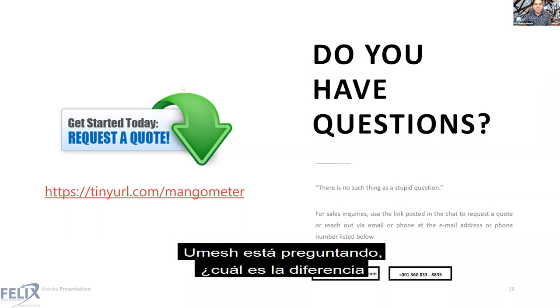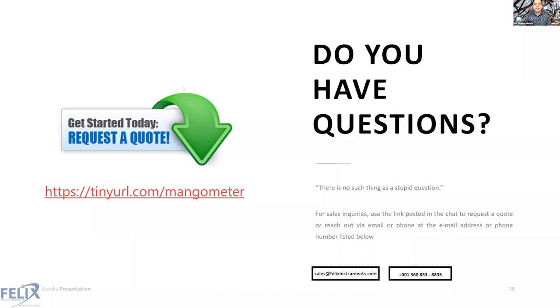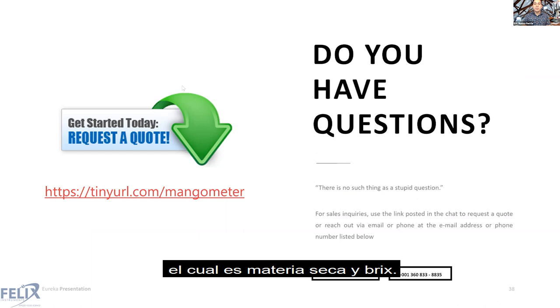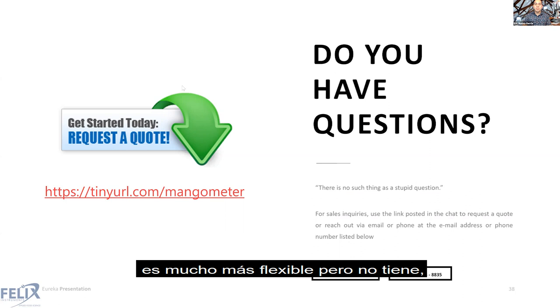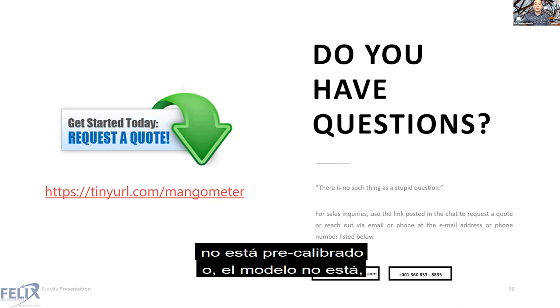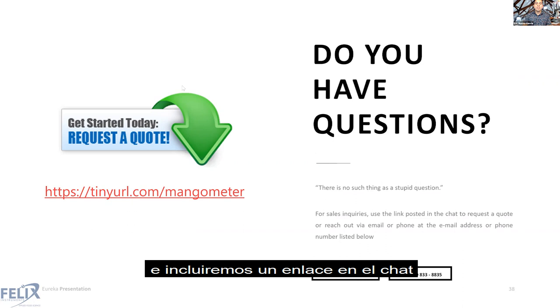Umesh is asking, what is the difference between F750 meter and mango meter? The mango meter is a single commodity instrument, so it comes pre-calibrated, ready to use right out of the box based on the model provided, which is for dry matter and brix. The F750 is our produce quality meter, much more flexible, but it's not pre-calibrated and there aren't any models included. You can download the models off of our website, and we'll include a link in the chat box where you can find those.